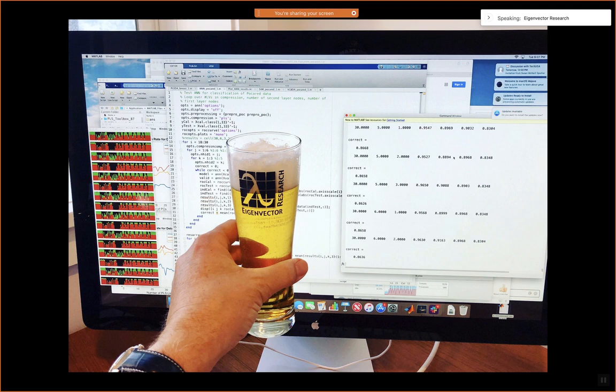We had one about the RGB colors, probably when you were adjusting the gun order. Can you change the colors for the PCs in that RGB, or in the three slabs? Yes. You can select any three PCs to display as red, green, blue, and then choose what order you want them to be, which one you want to be which, by changing that color gun order.